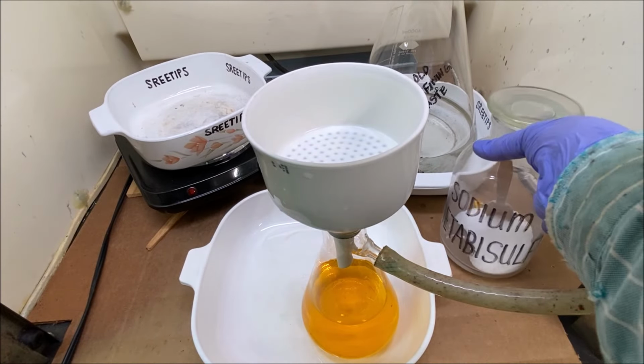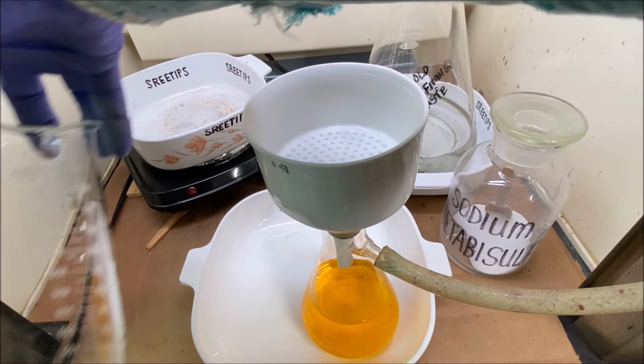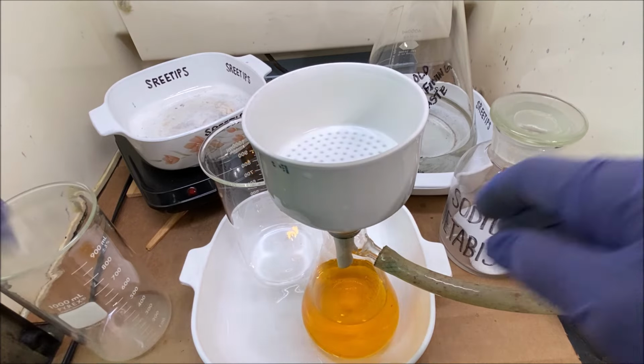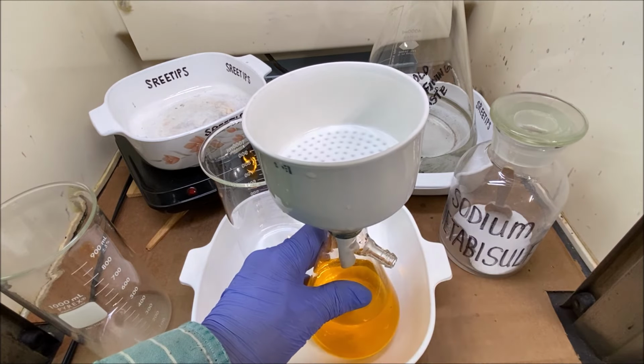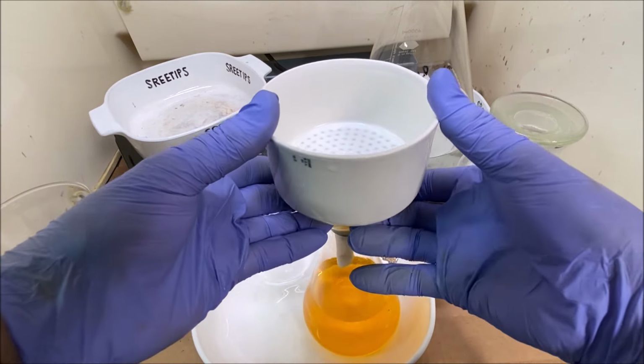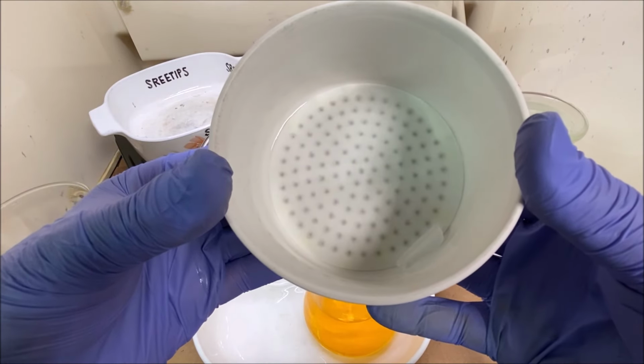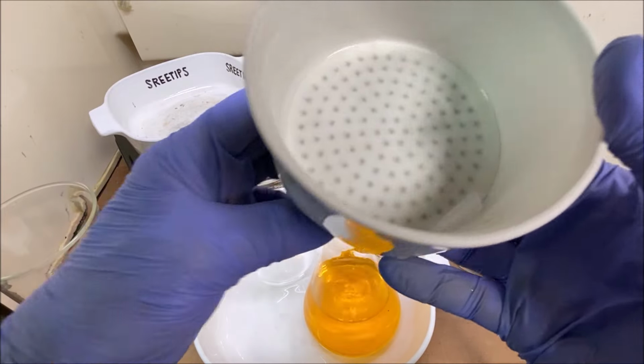This looks real good. Got a squeaky clean beaker right here. Let's get rid of our funnel. You can see there's some gray material down in there. Put that in our paper storage.